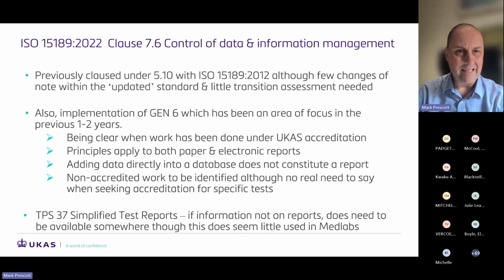There are some comments in there that, and this one's always a little bit unclear to people, myself included, about when you're adding data directly into a database, but it doesn't actually constitute a report. So there is a bit of a risk there of, at what point does a report become a report, and at which point is it just some data? But I don't know that we do see too many instances of that, to be honest.